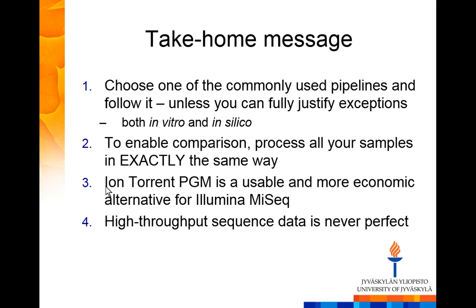And seeing these comparison data, I at least am still fully happy using Ion Torrent PGM. If you want to use it commercially, well, we collaborate with people, but we cannot collaborate with everyone. But University of Oulu sells PGM runs at a definitely good price.